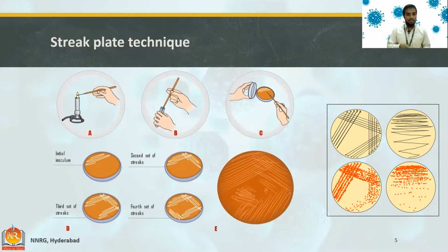And another thing, we need a petri plate and a solid medium in that. So basically, the petri plate will be taken and a melted agar will be added and allowed to cool. Okay, and after some time, the petri plate will be solidified. You can see the image here. This is a solidified petri plate. Again, the type of medium, you can see brown color, that is heated blood medium. Okay, this will be the petri plate.